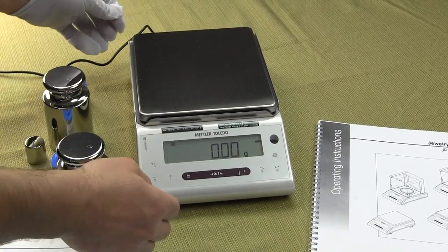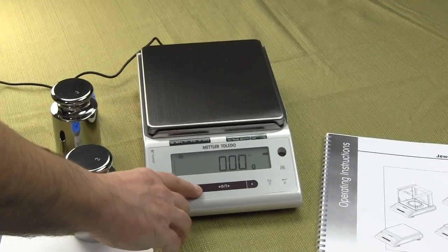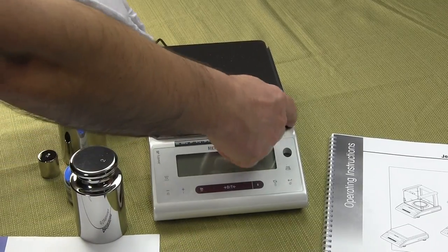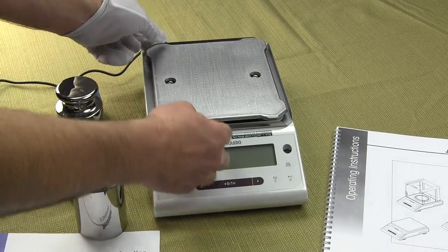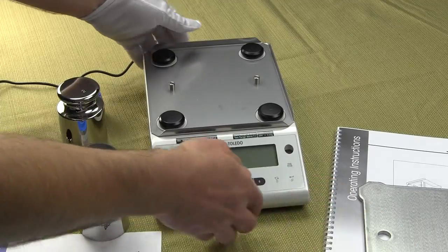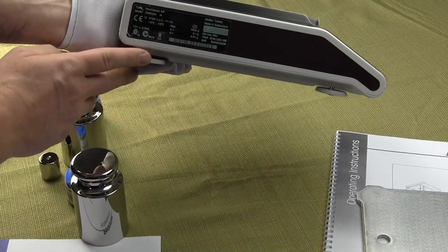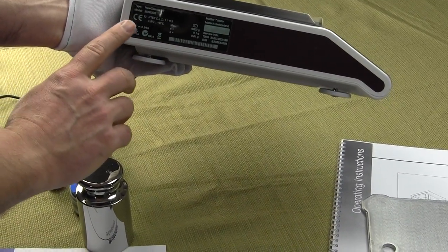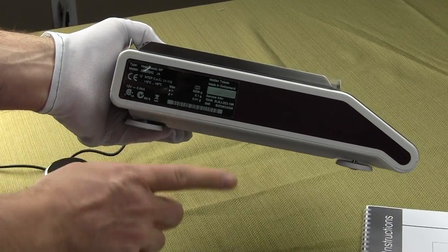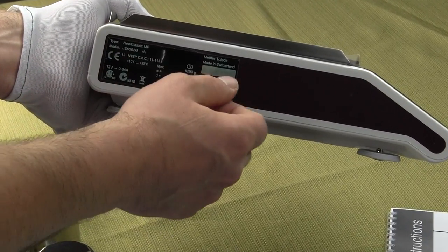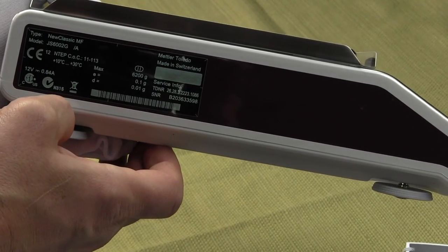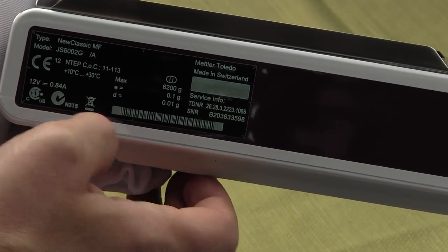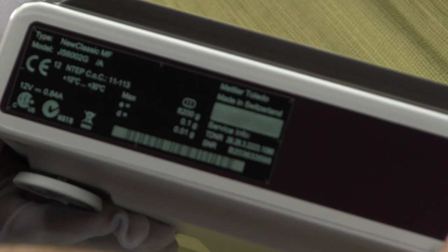Some more features on the balance here. On the side of the balance, you'll notice, since this is a legal for trade balance, Mettler Toledo puts, it's made in Switzerland. The C of C is depicted on the balance here. There's a certificate of conformance. So you see right here, NTEP, C of C. So the C of C marking is here in the model number.